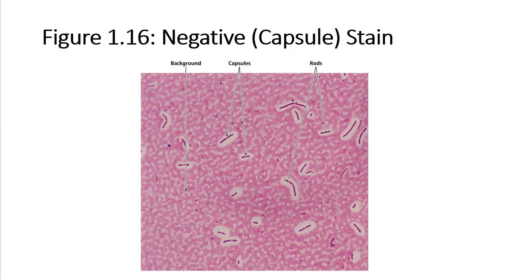And it's attracted to that cell wall, it pulls it in, and it holds it. A negative stain is negatively charged. So negative repels a negative. So you're using a negative stain to look at this. And this is a real quick way to look for something. Again, with any India ink prep that we do, we're looking for Cryptococcus. And it takes 2 seconds to put India ink on a dot of spinal fluid and put it under a microscope. Yeah, I can see something. No, I can't. That quick.